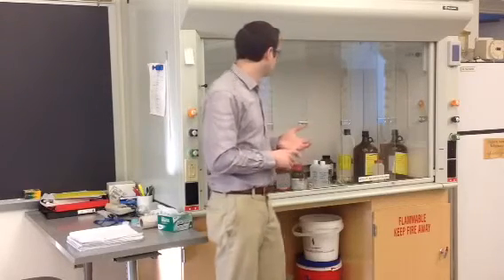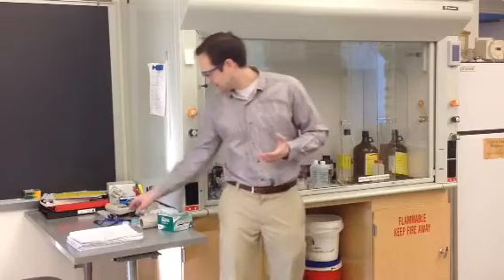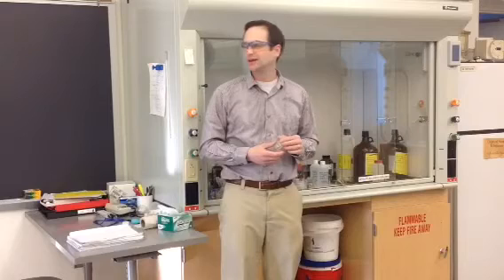All right, so what I'd like to do is basically put together how you would do this. You take your reaction flask, and I think a 100 ml round bottom is probably going to be a safe bet. 50 ml might also work. It depends on whatever volume gets you below halfway filled. That's really important. So you're going to take your round bottom, put a stir bar in it, and then add in your alcohol and your carboxylic acid.